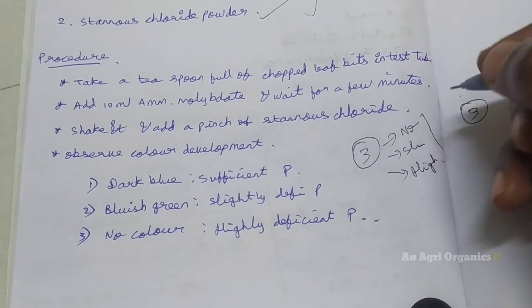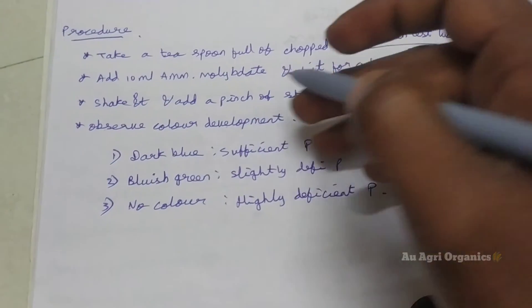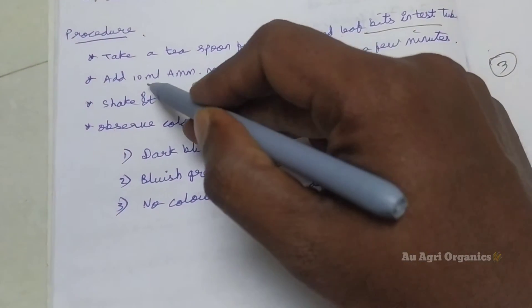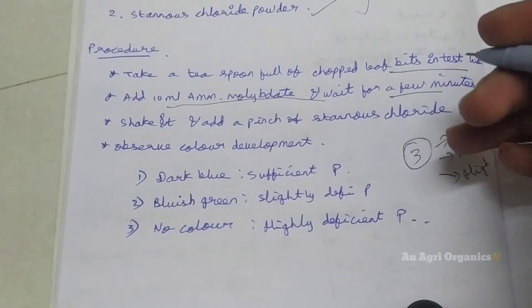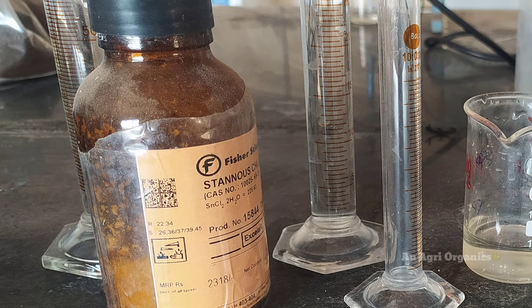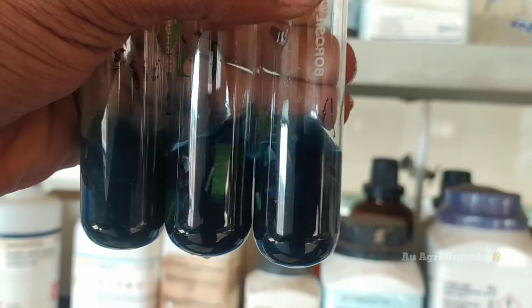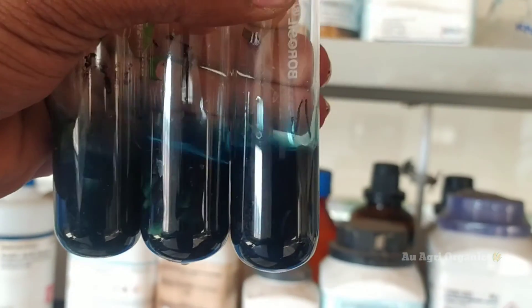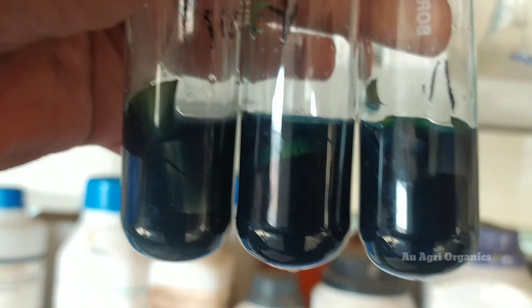We have to chop the leaf and take it in a test tube — a small test tube is enough, or we can use a falcon tube. Then we have to add 10ml of ammonium molybdate solution and wait for a few minutes. After shaking, we have to add a pinch of stannous chloride — just a pinch is enough, no need to add more. After waiting for 1 to 2 minutes, we can observe the color development.